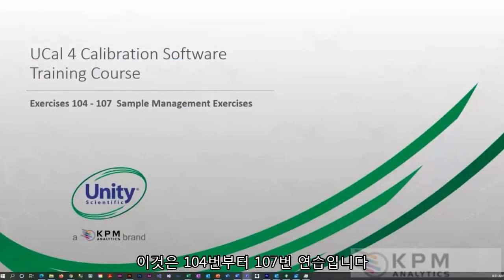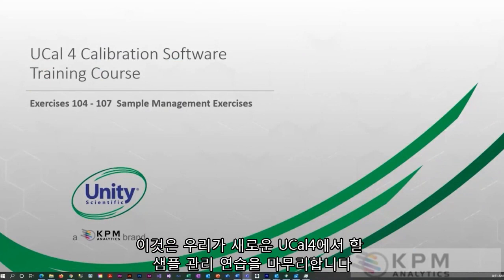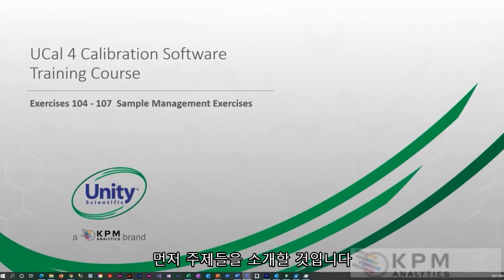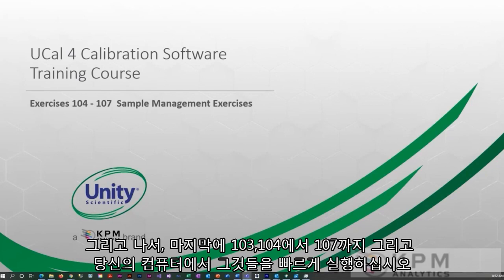Hi, this is exercises 104 through 107. This is wrapping up our sample management exercises that we are going to be doing with the UCAL4 program. We put them together just because each one of them is a small little function and we just wanted to address these. So I will introduce the topics and then please at the end of this just run through 104 through 107 quickly on your computer.